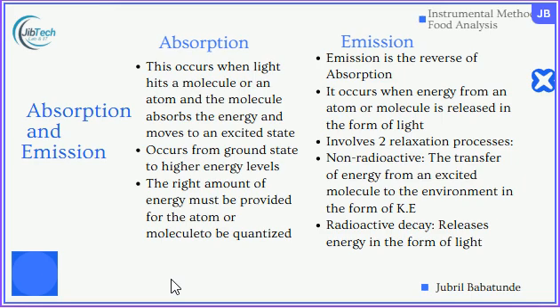Of course, when light hits a substance, a molecule, or an atom, it moves from the ground state to the excited state. So that is just absorption. But there are a few things we need to understand in this absorption.